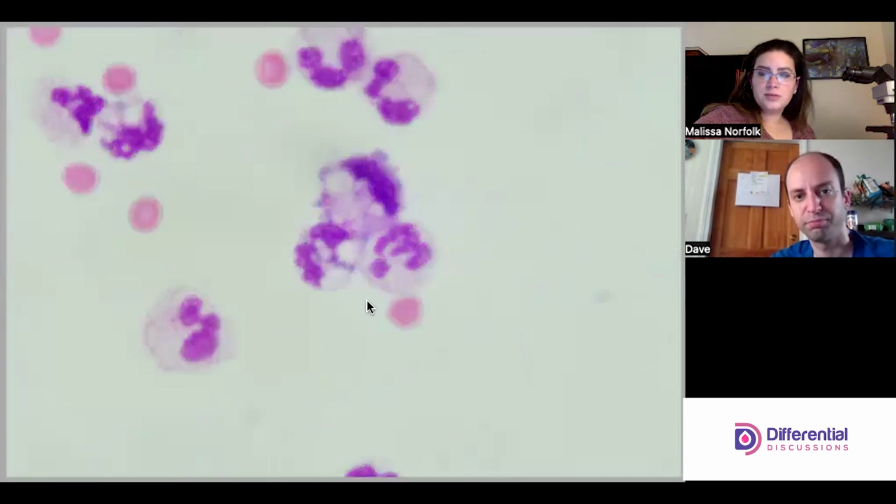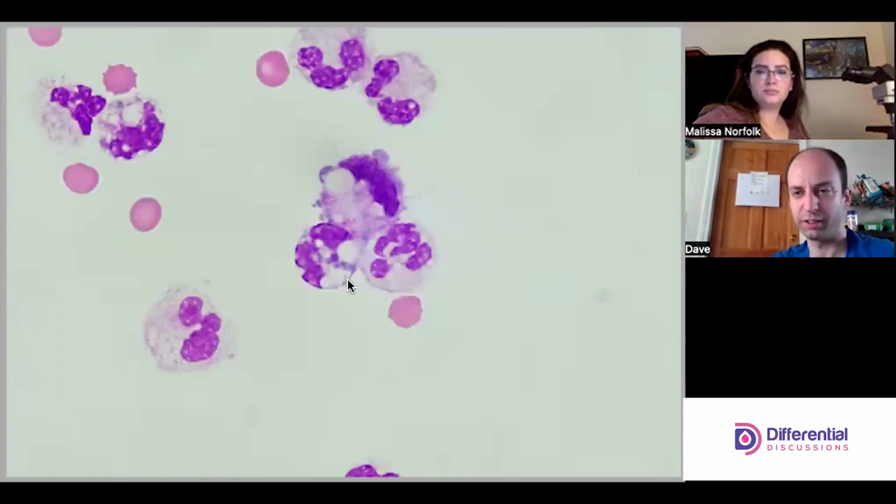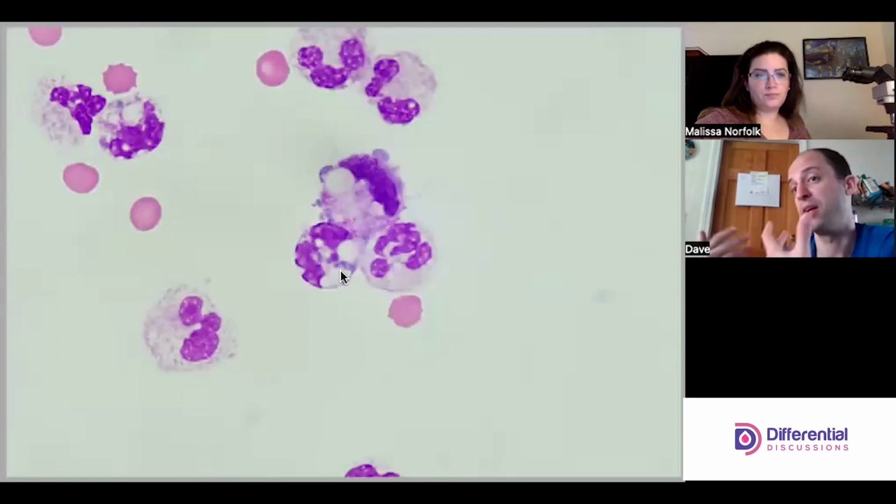In here, this is kind of looking like some blue-black granules. Oh, cool. Blue-black granules would basically be the precipitated iron that's left over after red cells have been digested, essentially. When you bleed into a tissue space, there will be phagocytic cells that eat the red cells and break them down. After lysing, the hemoglobin gets metabolized. So it's not uncommon where there might be a bleed.